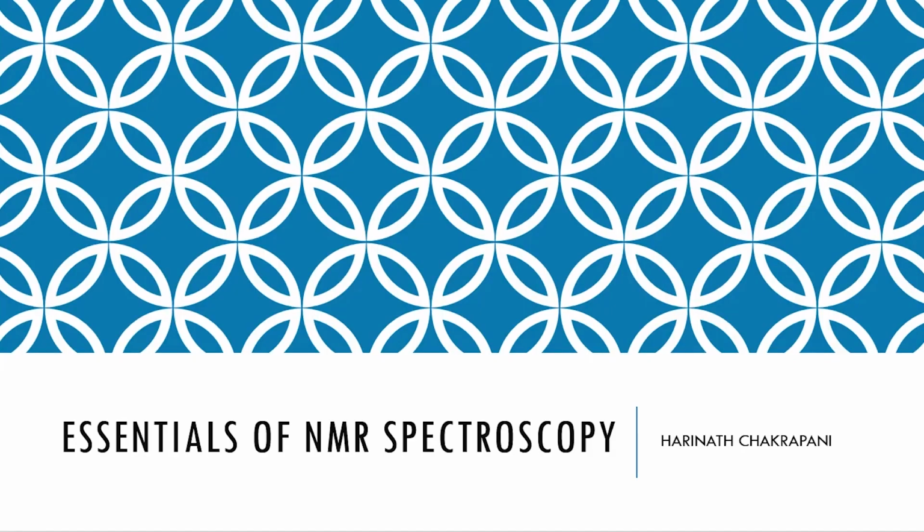So, let us start. In this course we would need to understand the fundamentals of NMR spectroscopy, and in this lecture I am going to discuss with you some of the essential aspects of NMR spectroscopy. As you know, NMR spectroscopy is a very vast field, and there are a lot of things that you would study in future about NMR, but what we need is essentially the real basics of NMR.